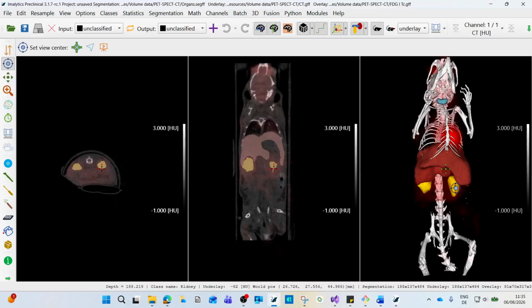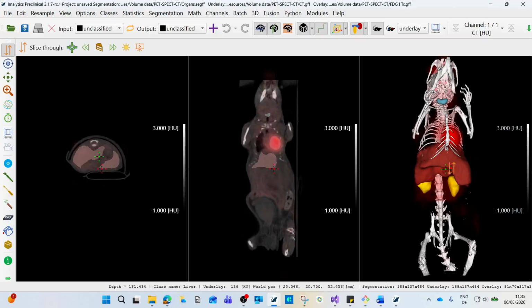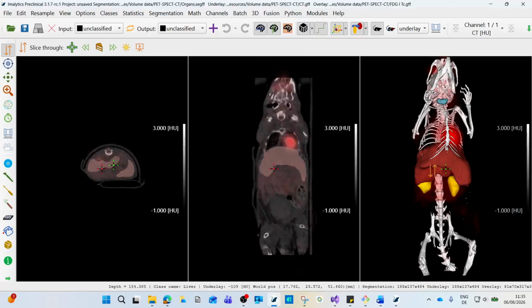This mouse mode makes it easy to quickly navigate around your dataset and find the right slice for your analysis. Because it's an important mouse mode, we also established a shortcut. For example, when you have another mouse mode activated, like the slice view, you can use the set view center by using CTRL and Left Mouse Button. So now I'm using CTRL and Left Mouse Button and I can jump around.